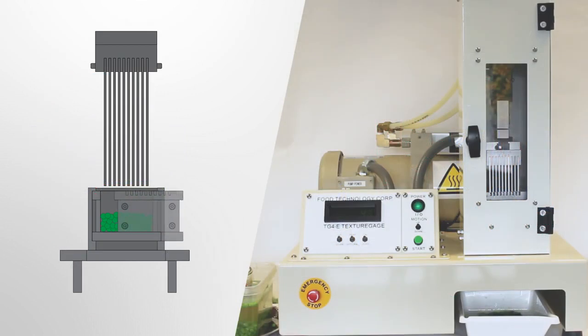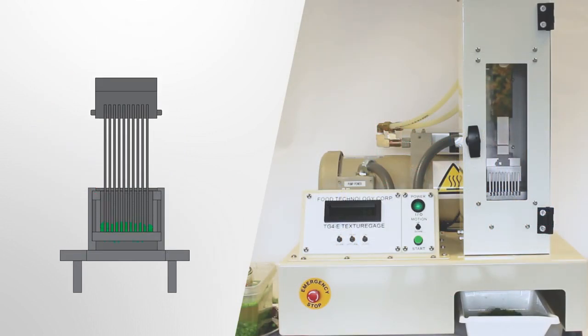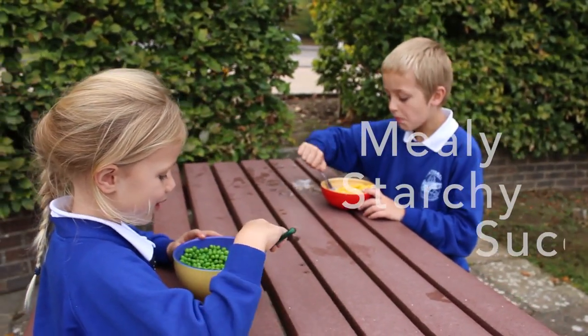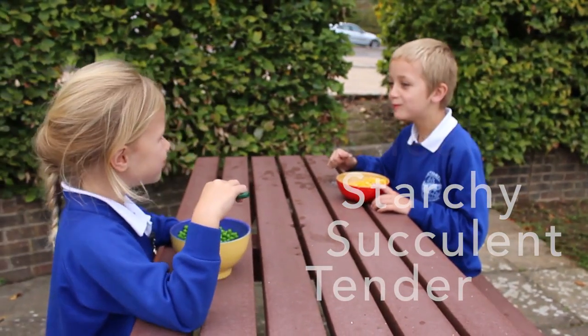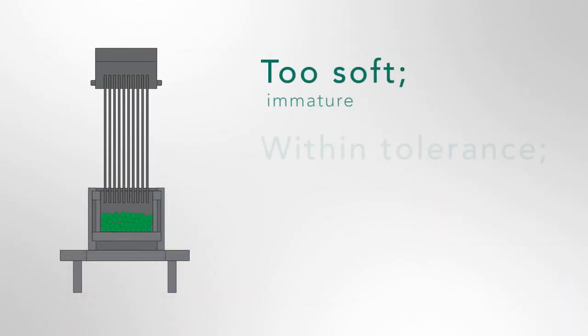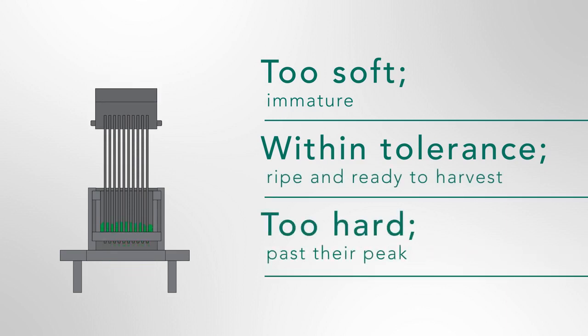To grade pea tenderness, we apply a force to compress and shear the bulk sample. The peak firmness recorded correlates to the sensory attribute of tenderness. Too soft: immature. Within tolerance: ripe and ready to harvest. Too hard: past their peak.